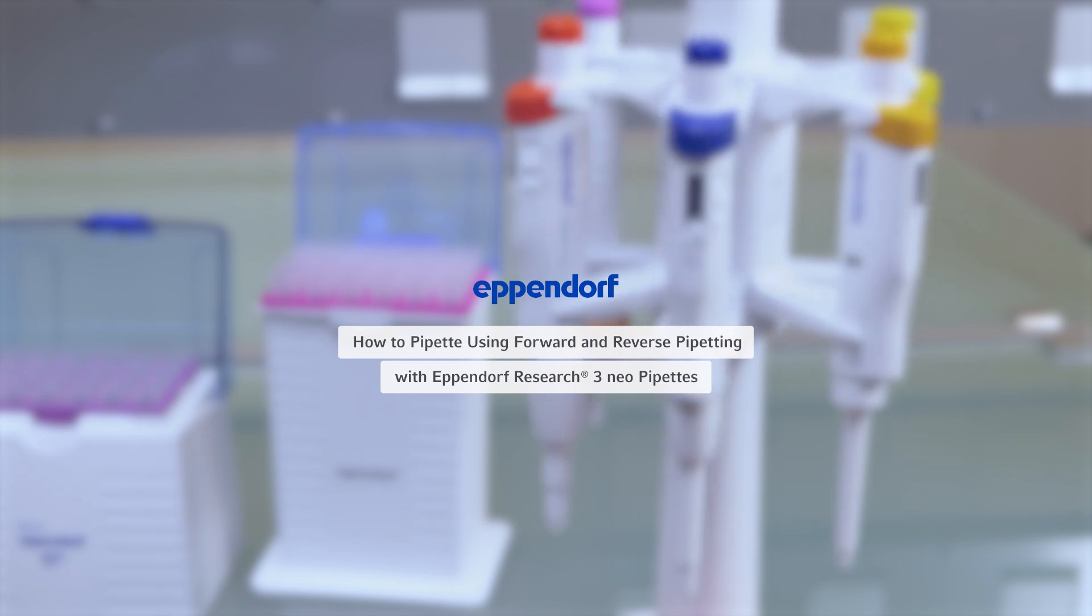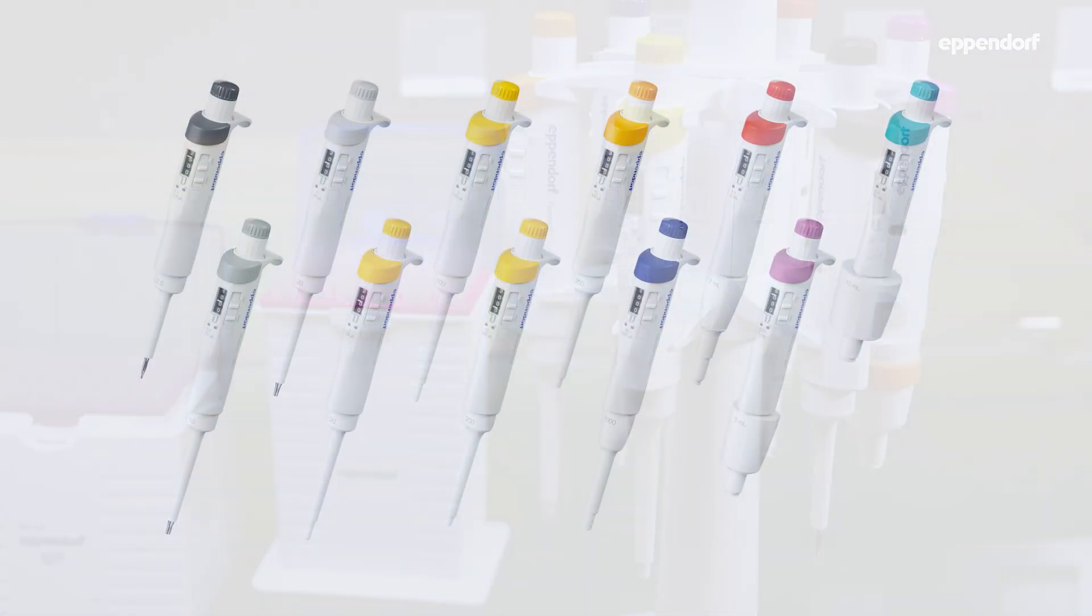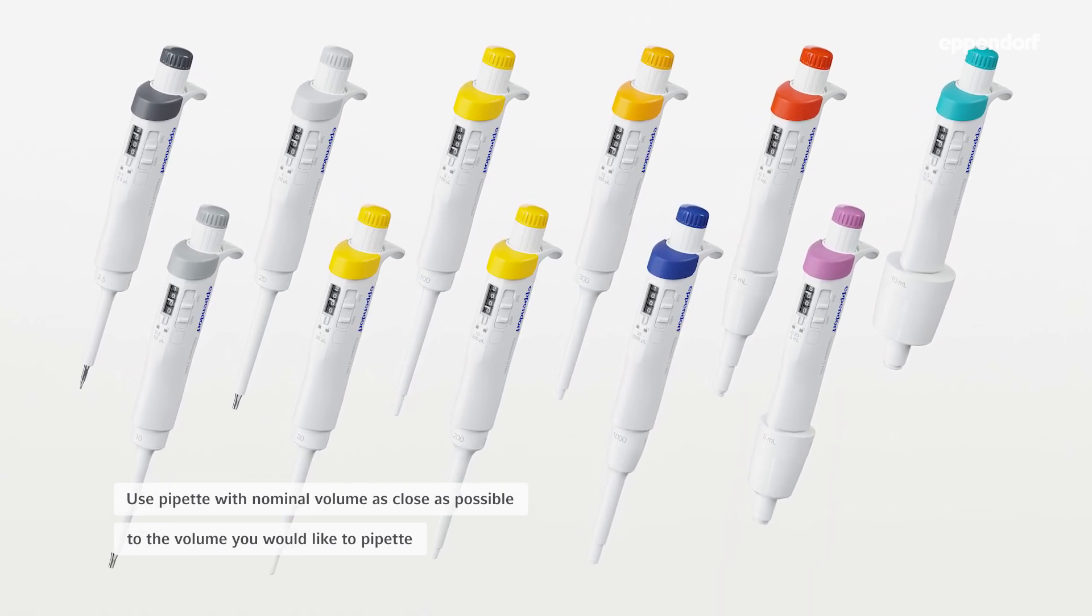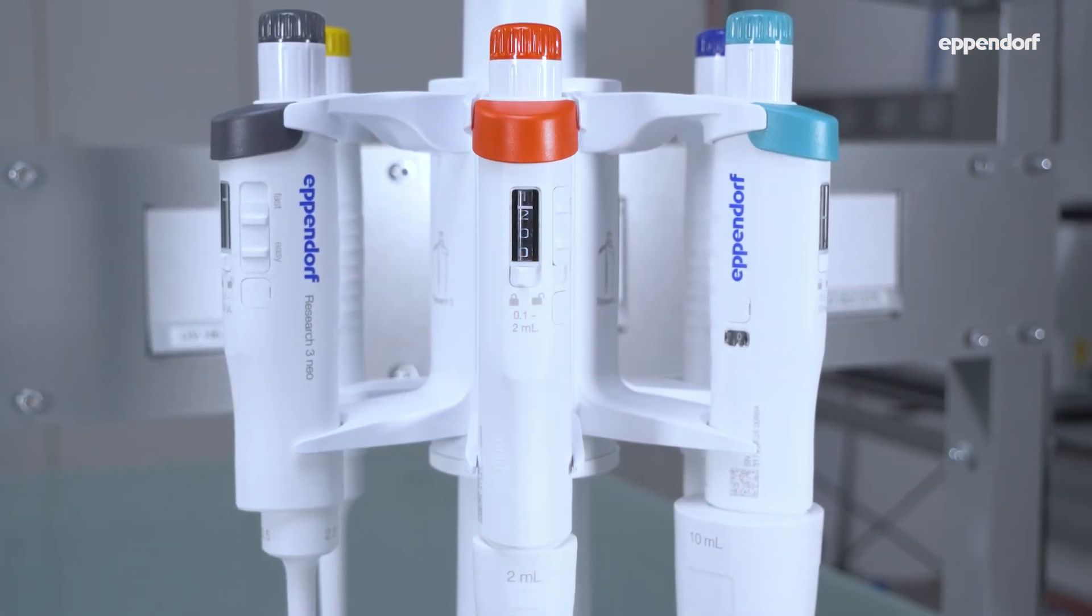The volume range of Eppendorf pipettes is printed on the pipette and represented by a color code. You should always choose a pipette with a nominal volume that is as close as possible to the volume you want to pipette, no matter if you are using the standard forward pipetting technique or reverse pipetting.